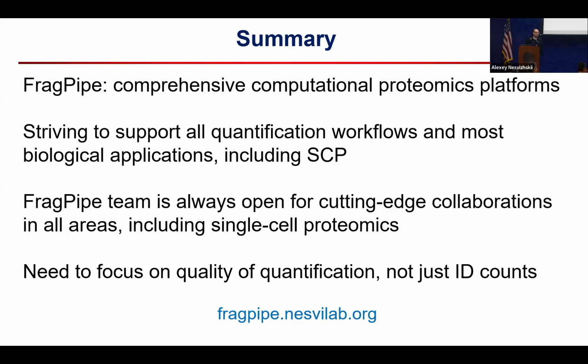I'll make one suggestion. I'm not saying that this is the ultimate and the best. I think this really has to be a wider discussion, but one metric that resonates with me is the consistency of quantification of the same precursor from different scans in, for example, Plex DI data. We normally have multiple MS1 level scans, multiple MS2 level scans, so it can allow us to quantify relative abundance changes across multiple Plex DI samples. And I think the consistency between those can be a useful metric.